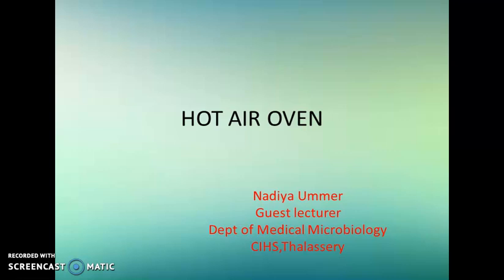So, in the last session, we discussed the methodology and instrumentation of the incubators. So, we have gone through the incubators. Today, in this session, we are going to discuss the hot air oven.